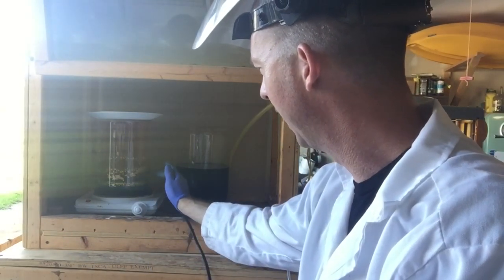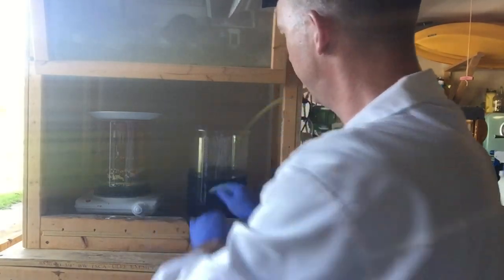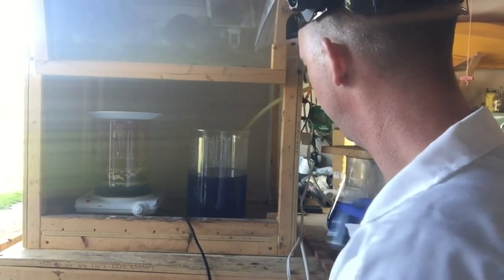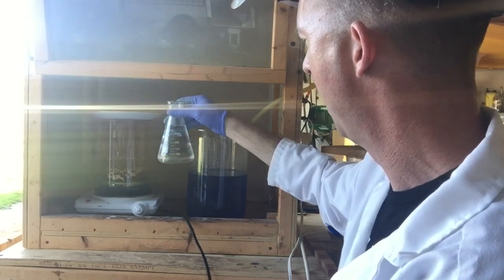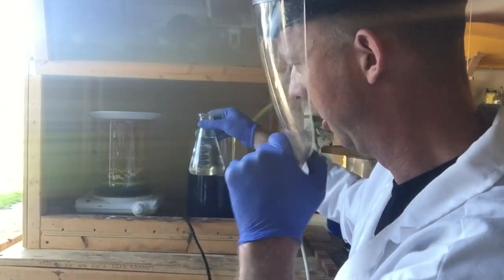I ended up letting this sit overnight and gave it a couple more nitric acid treatments. This should be the last one. Right now you can see there are a lot of gold foils. I've already got my silver liquid filtered up. What I'm going to do is get the silver chloride out of this — what I've got here is probably around 300 milliliters of hydrochloric acid, and I'm just going to go ahead and add it.